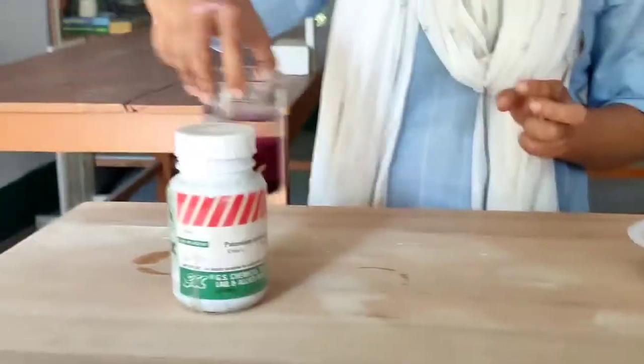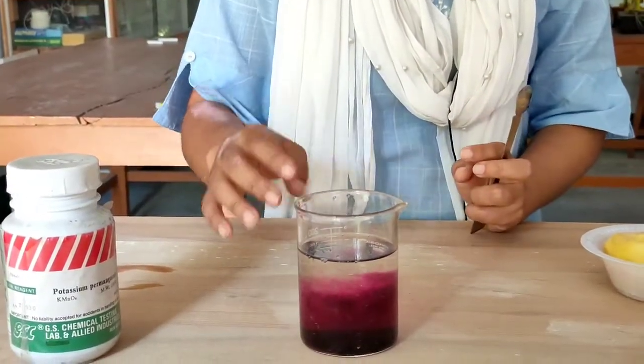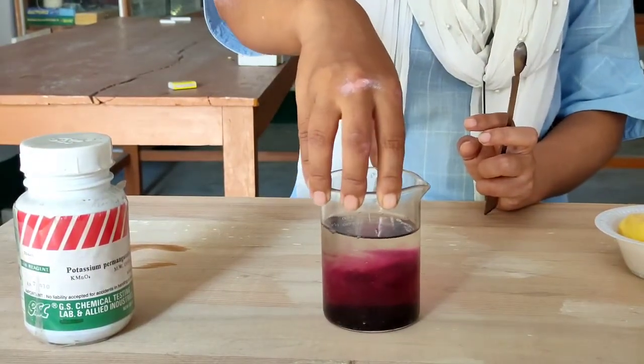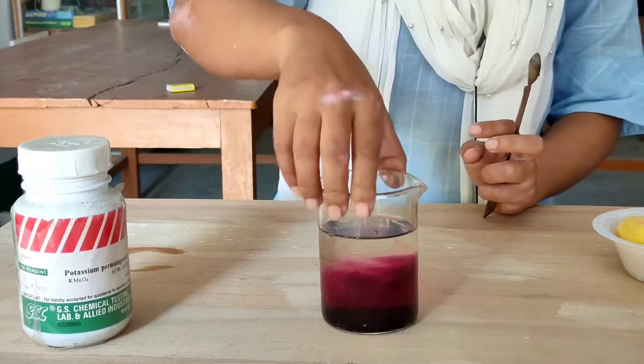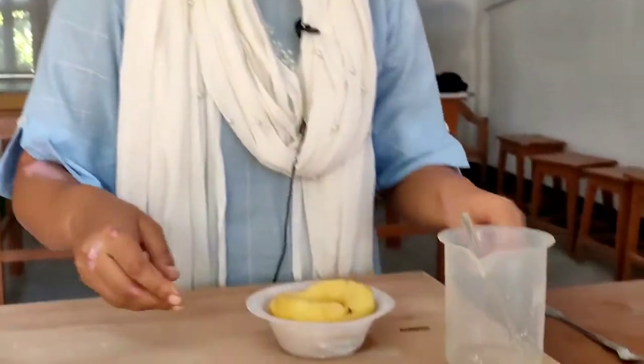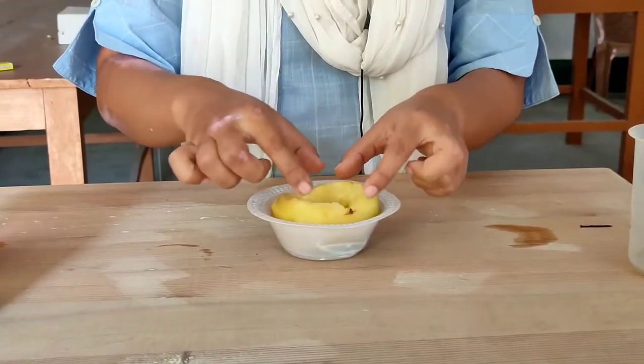So this proves that the solid particles moved from a higher concentration towards the lower concentration, thus turning the whole liquid pinkish. So I hope you understood what is diffusion. The potassium permanganate particles dissolved and moved from a higher concentration throughout the water present in this beaker.